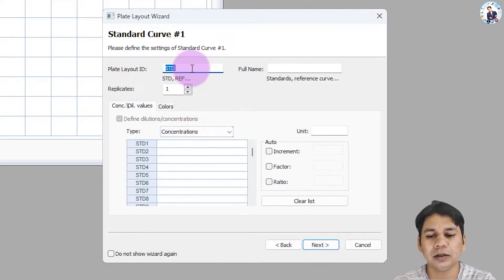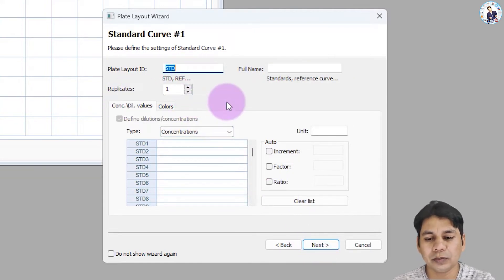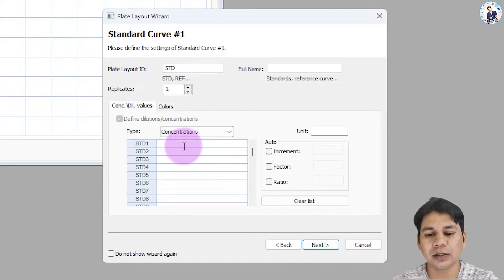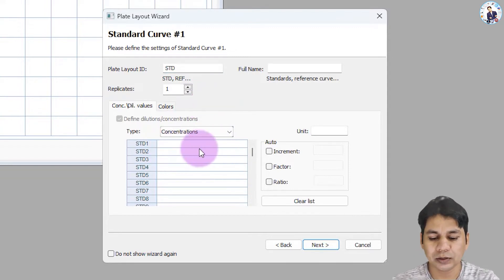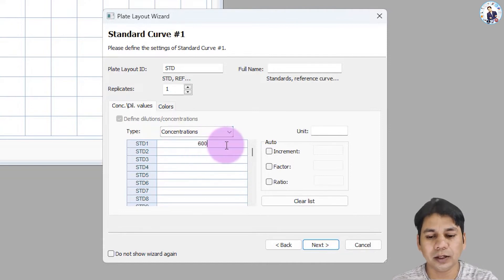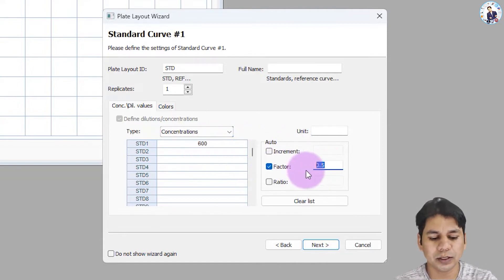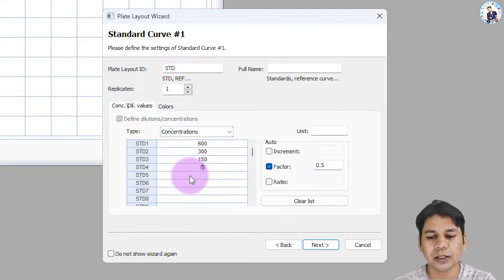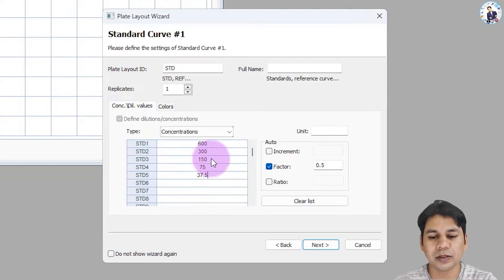The standard is in singlet in my case, so I am selecting the value for standard one. My first standard concentration is 600 pg. For the half dilution, I am selecting the factor 0.5. Click here and you can see the values assigned for each subsequent standard according to this dilution factor.